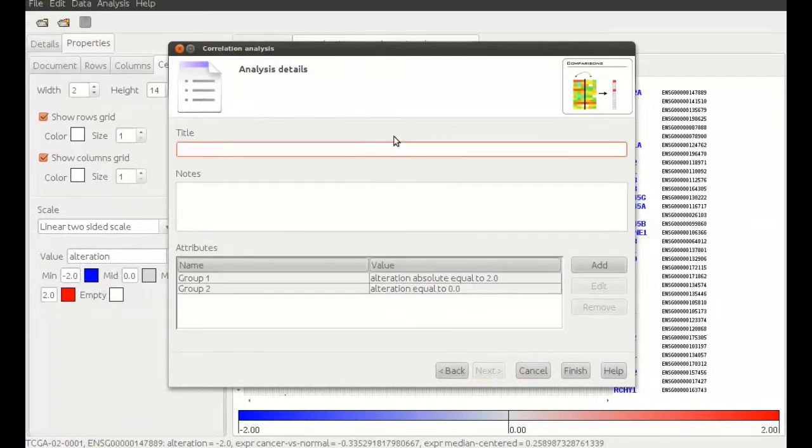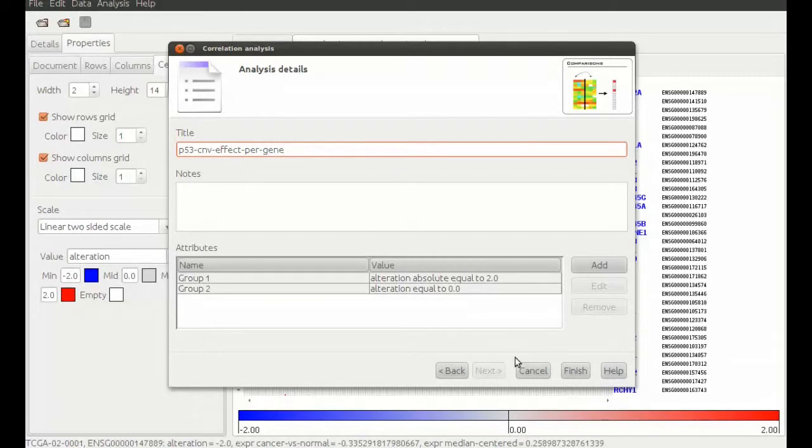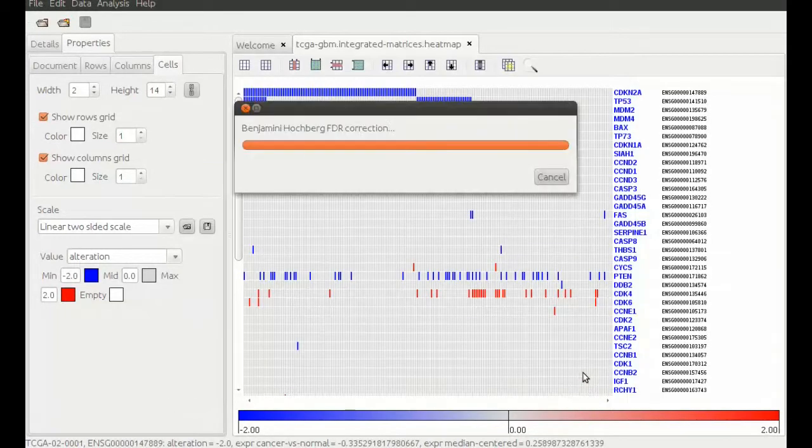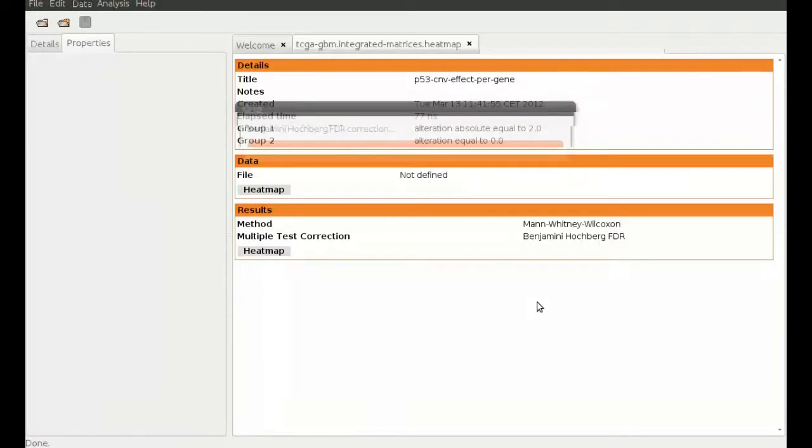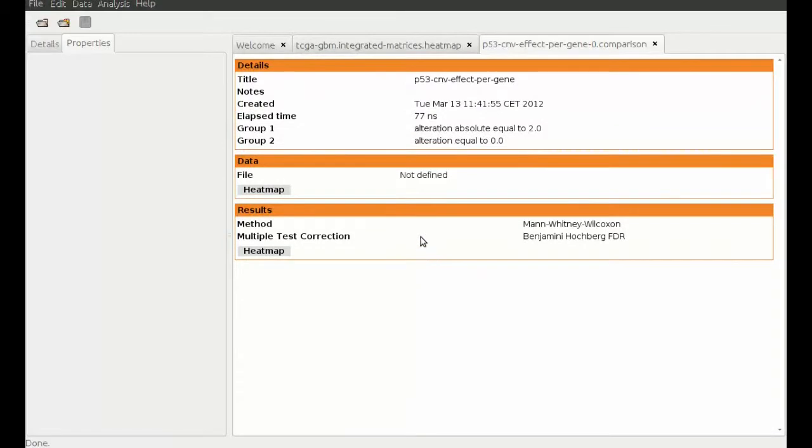We give the analysis a name and perform it. Once the analysis has finished we open it by clicking on the result heat map button.